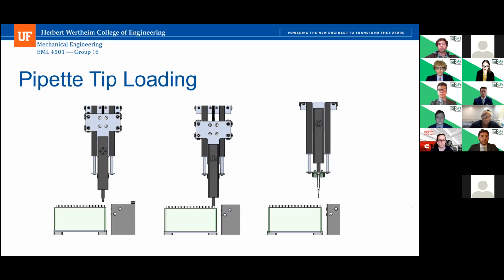Okay, so once the user has put in the well plate or conical tube, it's time to load the electric pipette. We wanted to satisfy the condition of needing to have 384 nozzles in use, based on the 384 well plate criterion. So we have a 3D printed cavity that is able to house 384 disposable pipette tips that are rated for 100 or 1000 microliters.